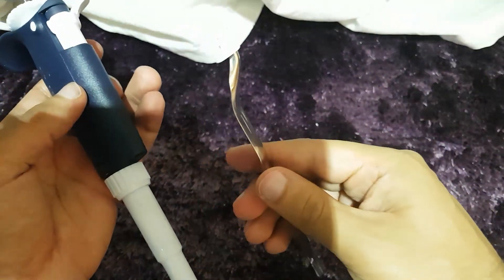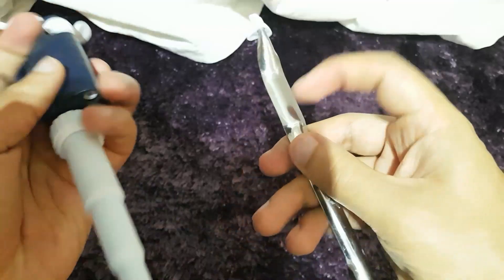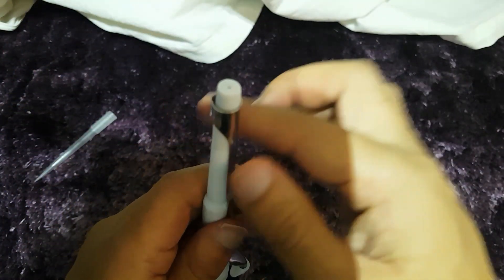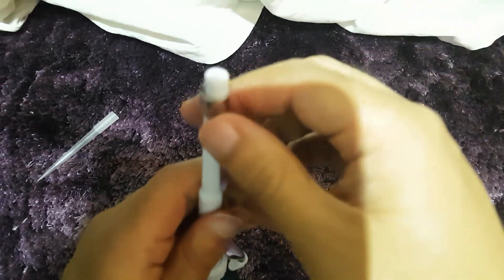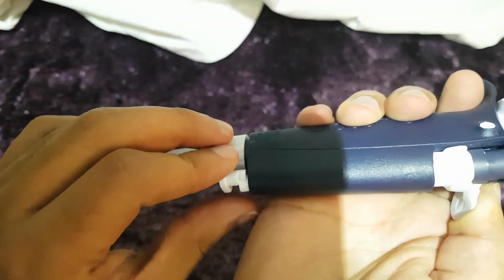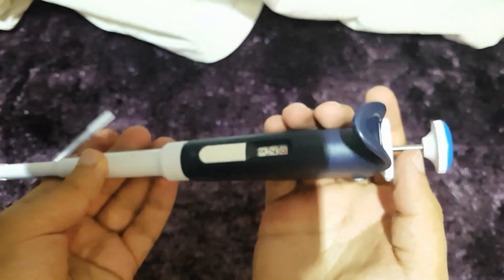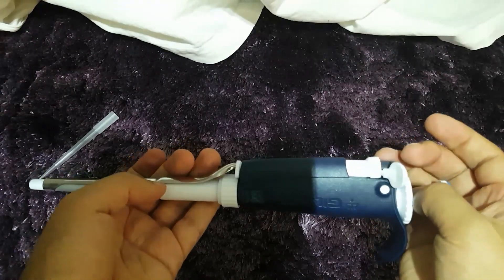Next step, we take the ejector arm. As you can see, the ejector arm has something there. You simply push that through here, slot it into place and wait for the click. There we go — we have our pipette back together again.